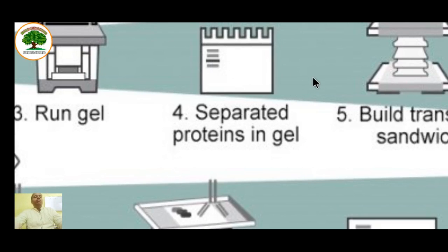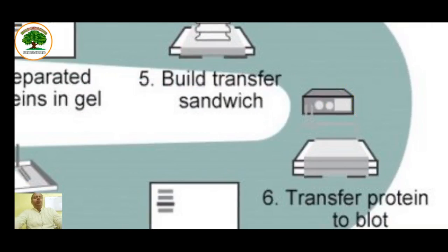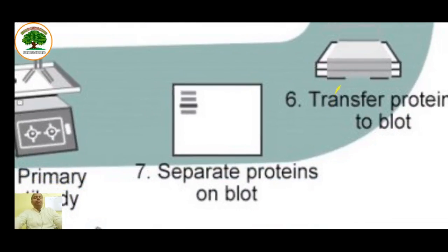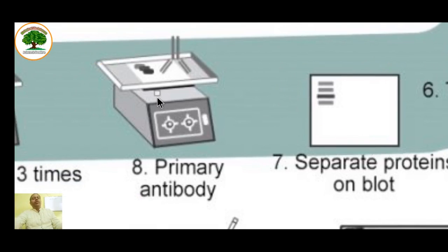The band is compared on the membrane as well as the gel. So again, this is created into a sandwich where on one side there is a membrane and on the other side there is a gel, and it is sandwiched using sponge and filter paper soaked in buffer. It is then electrotransferred using the classical capillary method or using an electroblotting assembly. Then the separated protein is blotted onto the membrane, and it is treated in an incubator shaker.